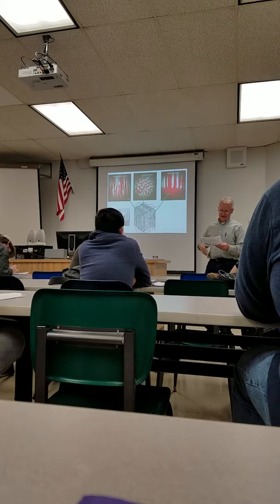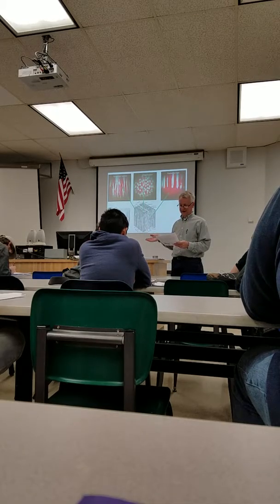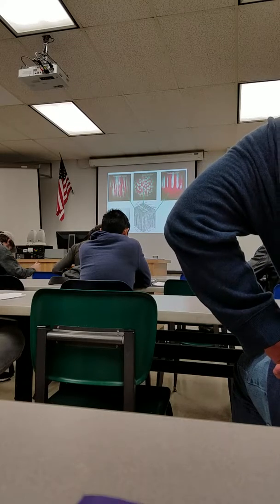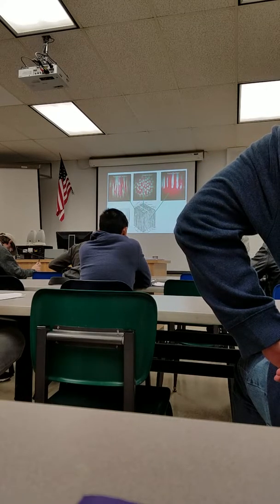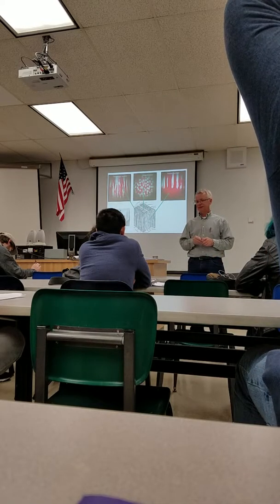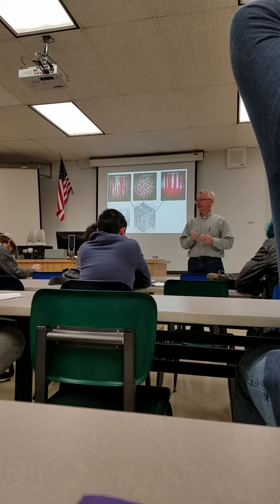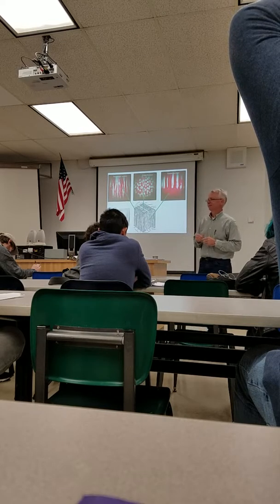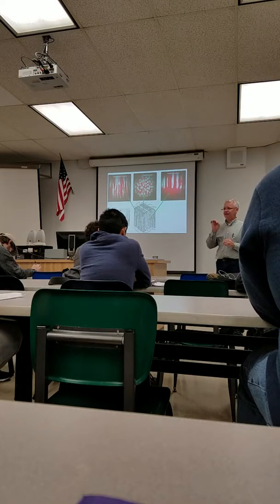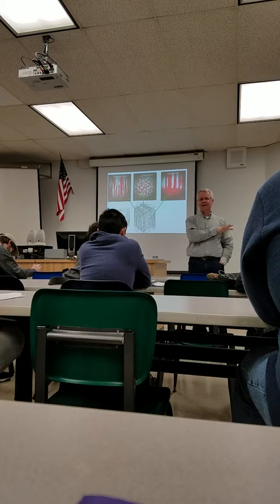Then the final exercise, also on the Canvas site. I used to do this in lab, but it was sort of uneven. What I did was take a brown paper bag and rip it up, soak it in water and macerate it. Then I took a suspension from that, put it on a microscope slide and took pictures of it. And then I did the same thing with white paper.